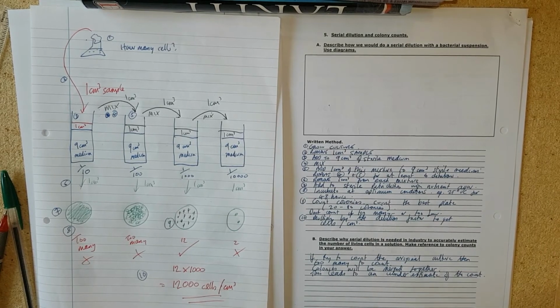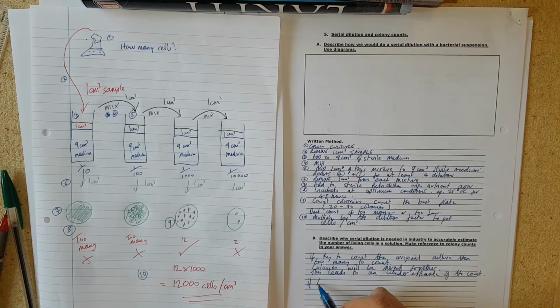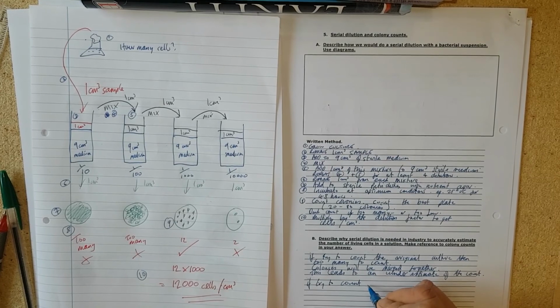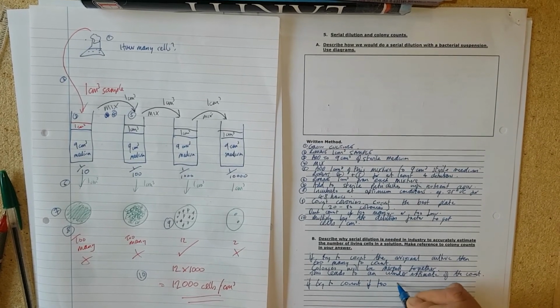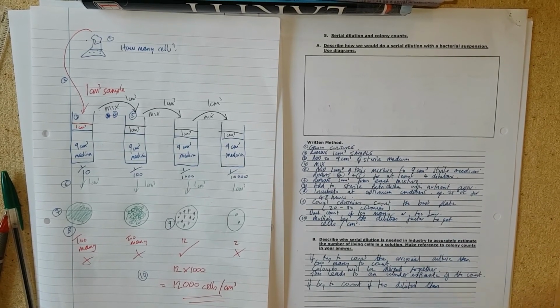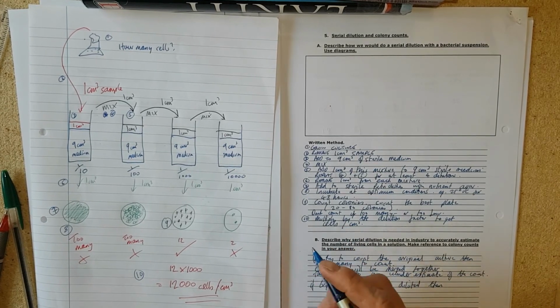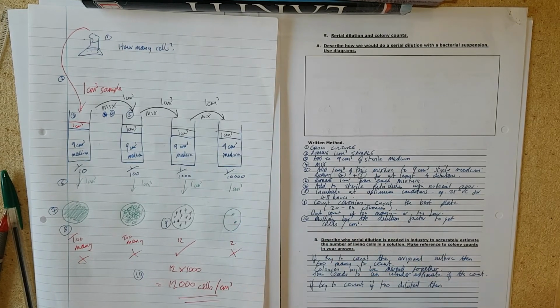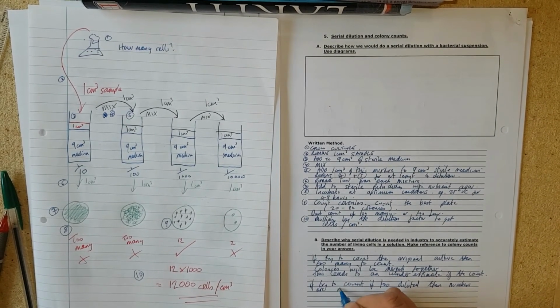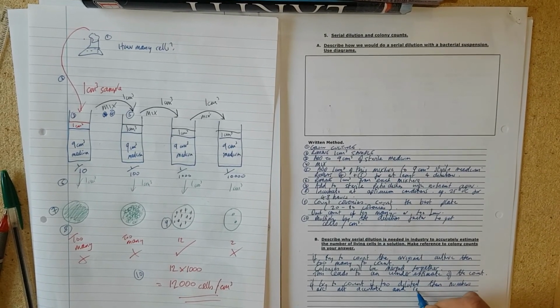And then likewise at the other end, if too diluted, then the numbers will not be accurate, because you might get 2 on this one and 4 on the next one and so on. Then numbers are not accurate and reliable.